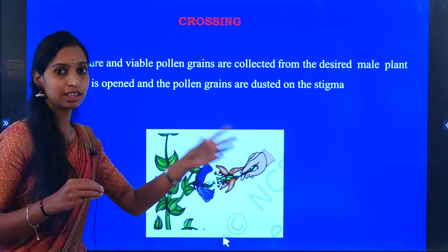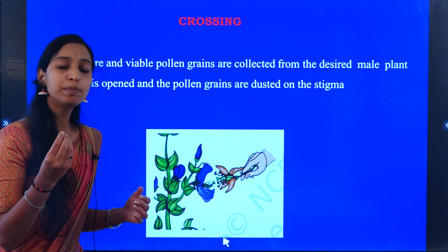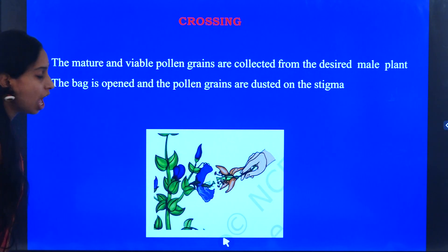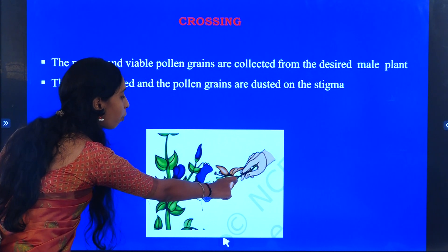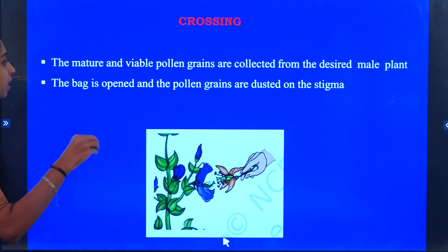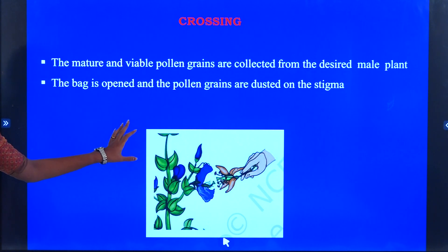The female reproductive part is already prepared with the emasculated flower. The viable pollen grains from the desired character are then applied by dusting on the stigma of the emasculated flower. This will help pollination.